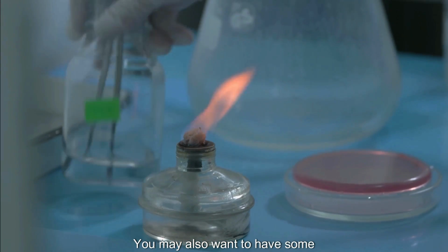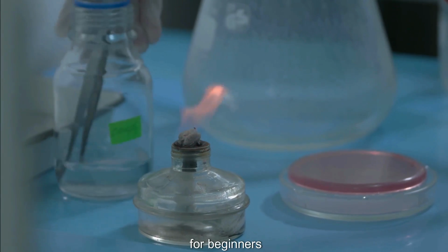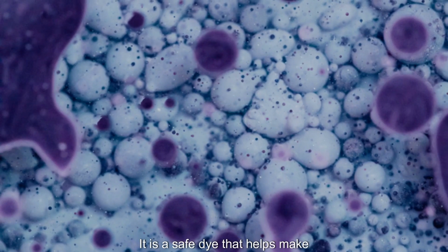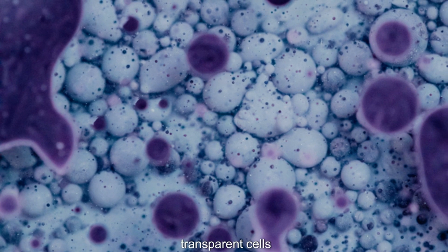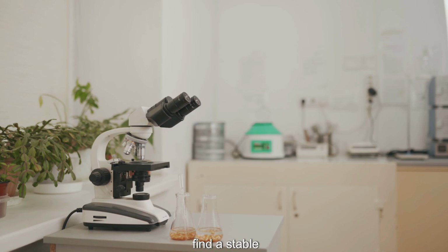You may also want to have some simple stains. Methylene blue is a classic choice for beginners. It is a safe dye that helps make transparent cells, like those from your own cheek, visible by giving them a rich blue color. First, find a stable, flat surface to work on. Good lighting is also important.